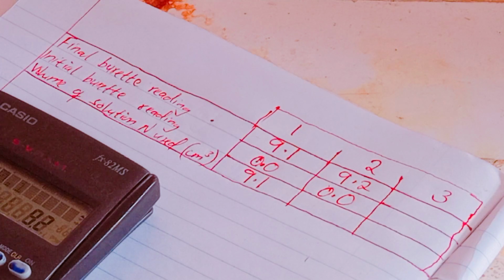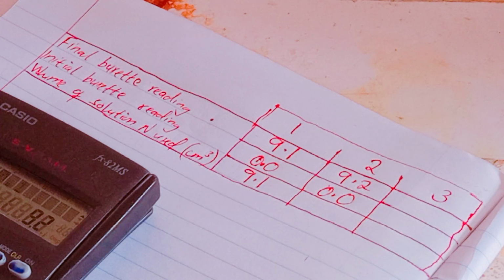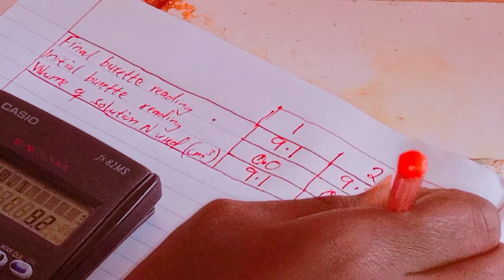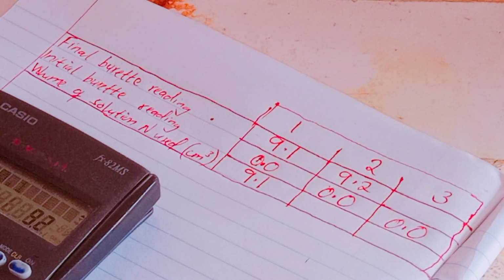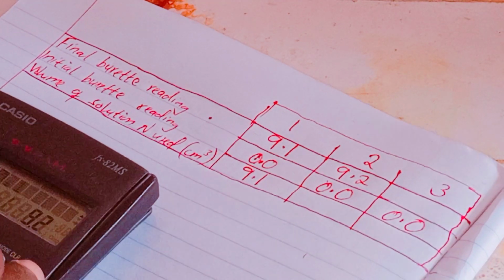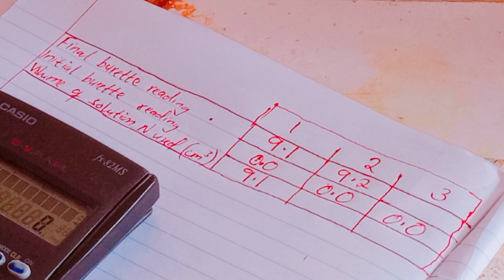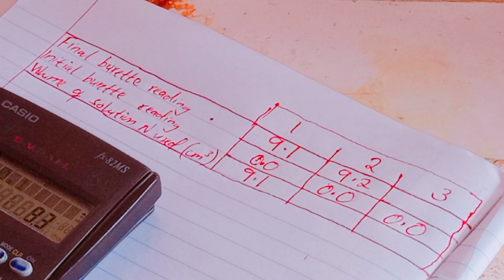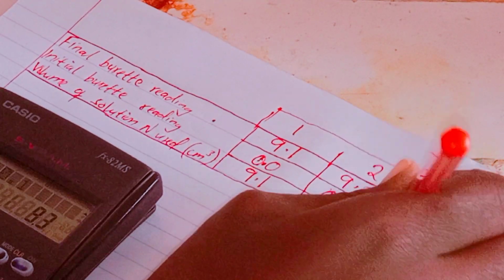Now for the third burette reading, remember these values should be within the range of plus or minus 0.1. The initial burette reading will be 0.0 because you refill the burette with the solution. The final burette reading again will be within that range of plus or minus 0.1. So if you take 9.2 and add 0.1, it will be 9.3.